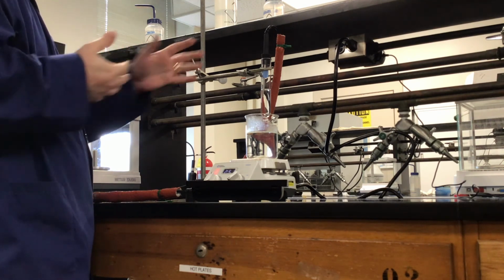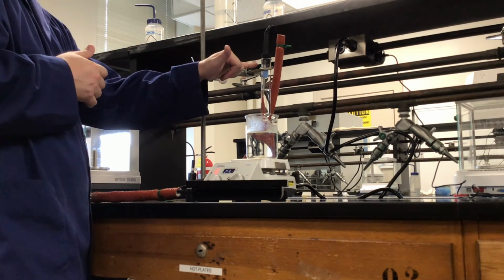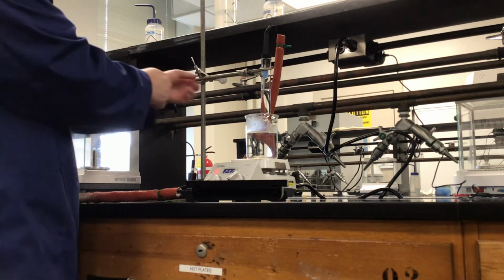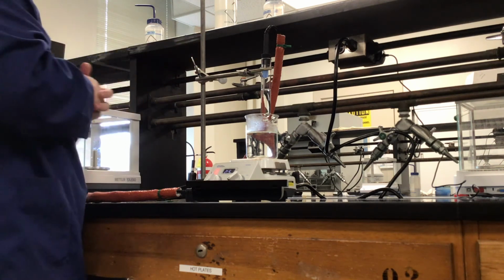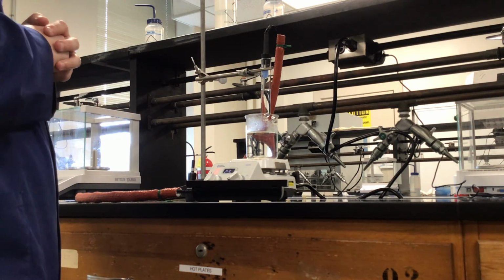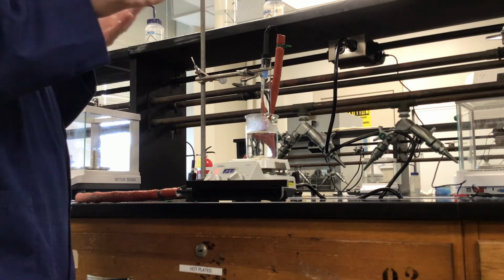Like I said, the biggest safety concern is just to be careful as you get close to the boiling point. If you're not careful and don't take it out of the heat soon enough, some of the ethanol can start to boil at the top. So just do be careful. If that does start to happen, you can still likely just raise it from the clamp. Don't try to reach in and touch the test tube itself, and it should be okay to go from there. But that should cover most of the experimental setup.